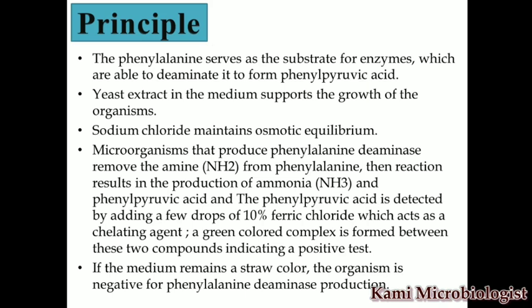Next point says that the yeast extract that is available in this medium is important to support the growth of the organism. Next we need sodium chloride, which maintains the osmotic equilibrium. So these are the main things that are present in the medium, and that is the most important working of these ingredients.